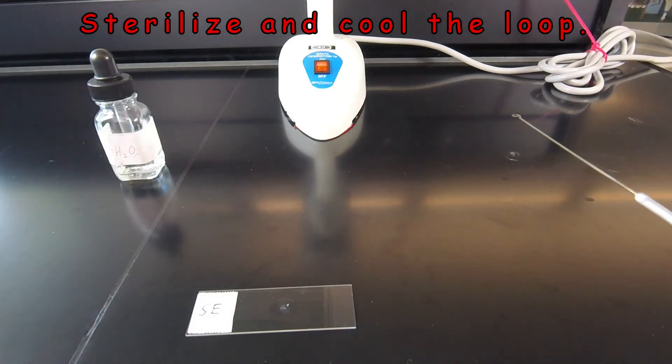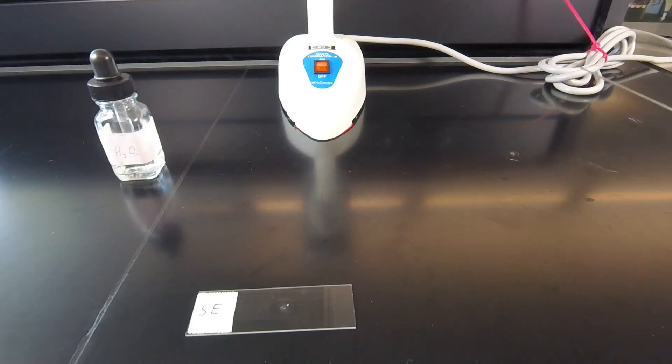And then at this point we have to wait for the inoculating loop to cool again. Because if we take the hot loop and put it in the water we're going to spatter the water all over us. So we have to either hold it in the air for 20 or 30 seconds or we could also stick it in the agar to cool, which I'm going to do just to speed up the video a little bit.